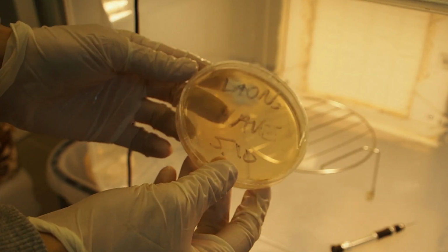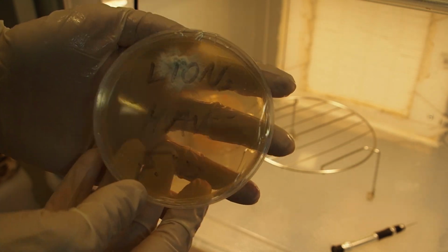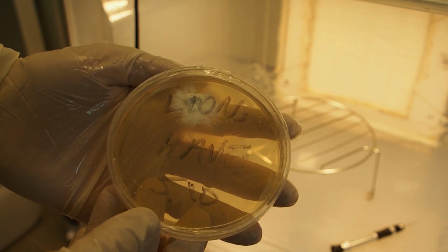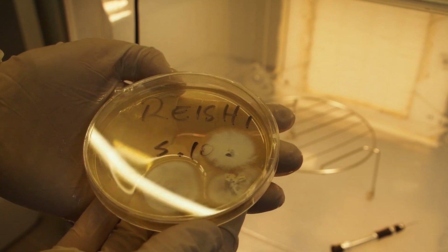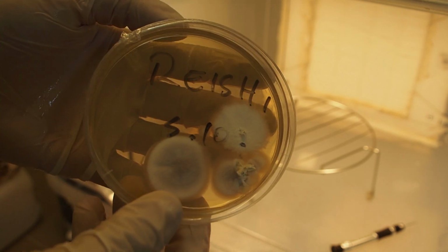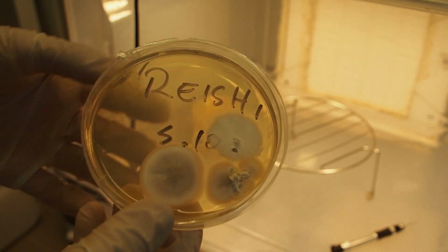Okay, now before we start, I gotta say that only one of five agar jars did not contaminate, so this is the one that survived, it's the lion's mane, so I don't have to clone this anymore. Then here's the reishi, it was a fail, unfortunately, so I have some brown mold in there, and yeah, it's pretty close to the mycelium of the reishi, so I'm gonna have to throw this one away.